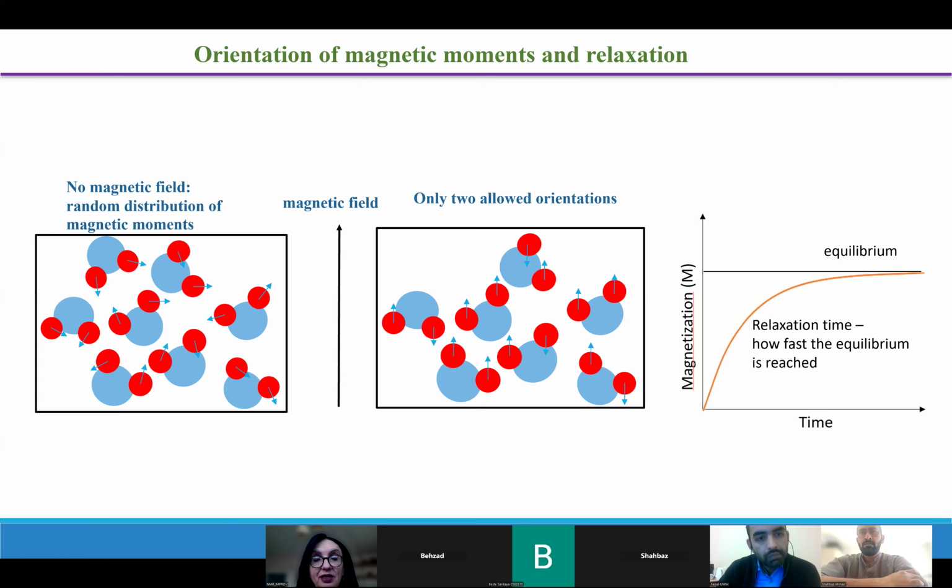Why lattice we will learn later. You can ask how long it will take. Well, it depends on many factors and can be extremely short, on the level of microseconds. For water, it is more than 2 seconds, between 2 and 2.5 seconds, which gives you a scale, yeah? This is actually the longest relaxation time.